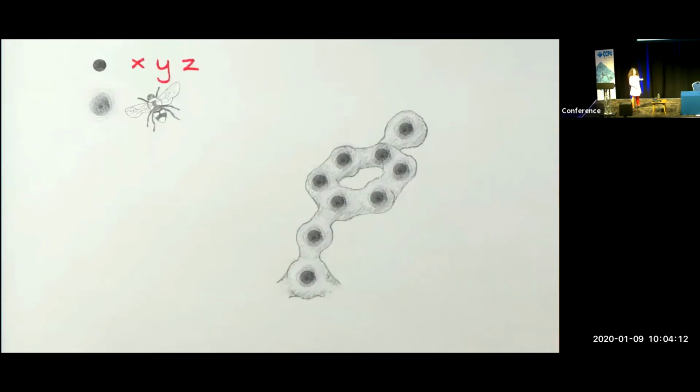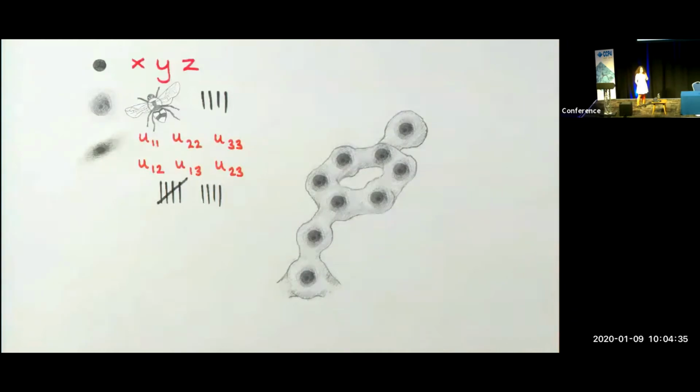And if you happen to have high resolution data, then we may be able to even model an ellipsoidal B factor, which when combined with the positional information requires a total of 9 parameters per atom. And this is also in comparison to the simple case using one B factor, which requires 4 parameters per atom.